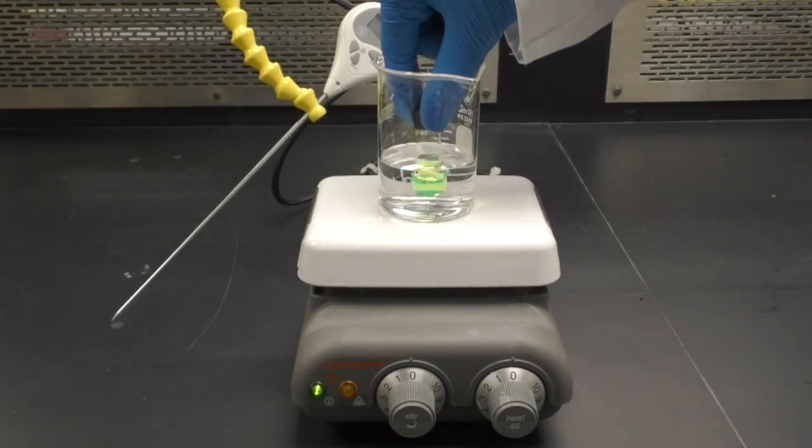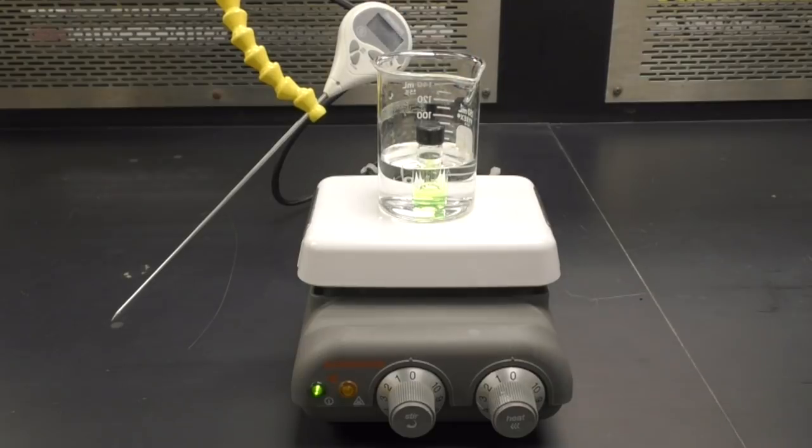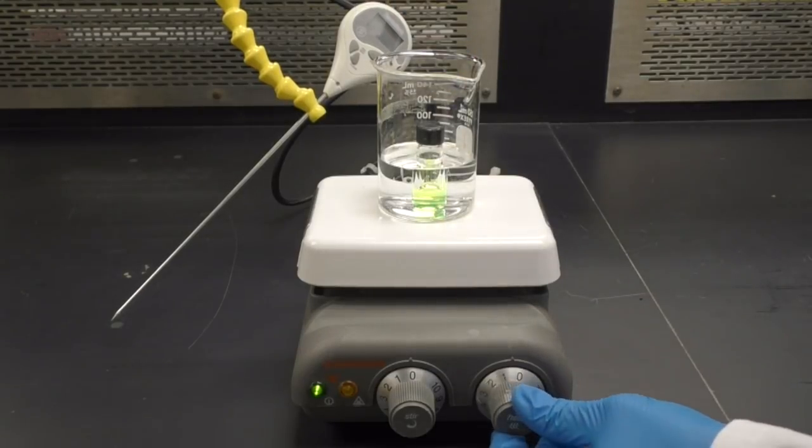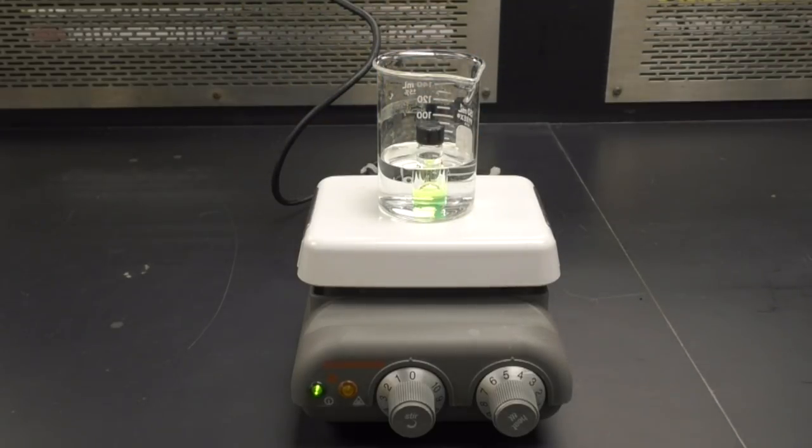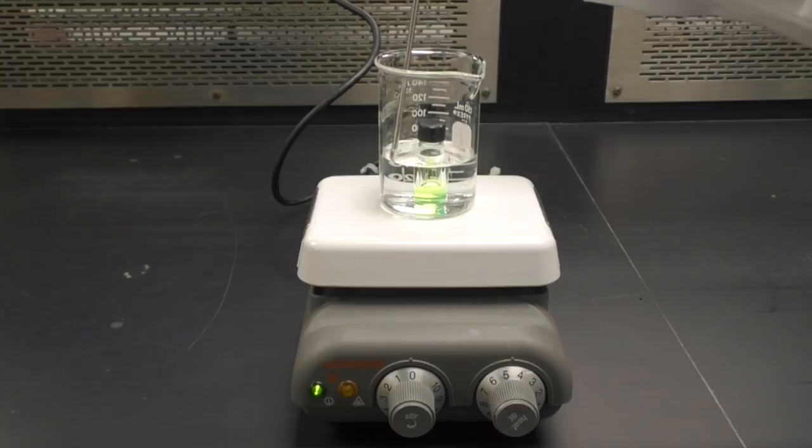For heating, you will need to fill a 150 milliliter beaker halfway with water and place your vial into the beaker so the bottom of the vial contacts the bottom of the beaker. You should also use a digital thermometer to monitor the temperature of your hot bath.